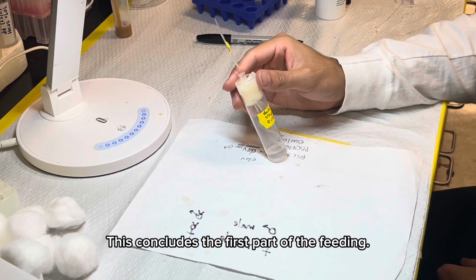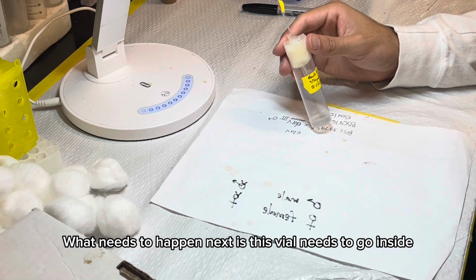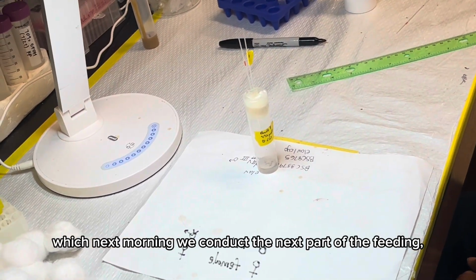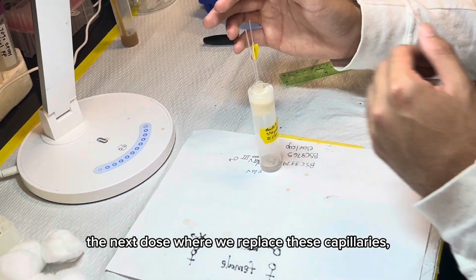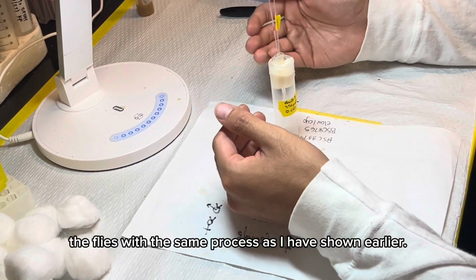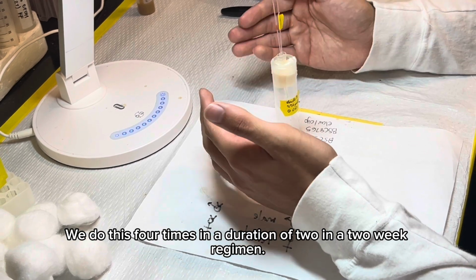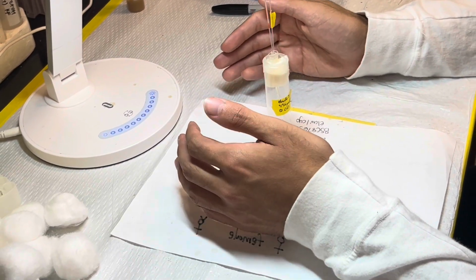This concludes the first part of feeding. What needs to happen next is this vial needs to go inside one of the incubators to store for next morning, when we conduct the next part of feeding, the next dose, where we replace these capillaries, measure how much is remaining, record it in the notebook, and refeed the flies with the same process as I showed earlier. We do this 4 times in a 2-week regimen.